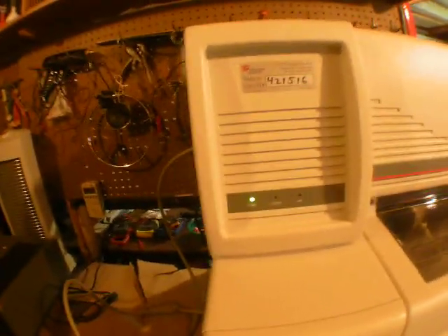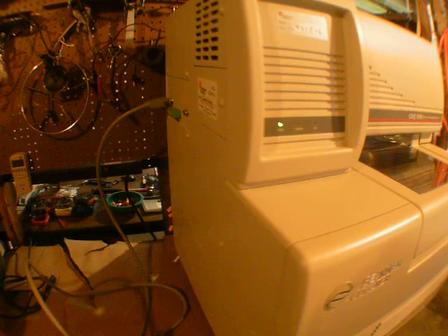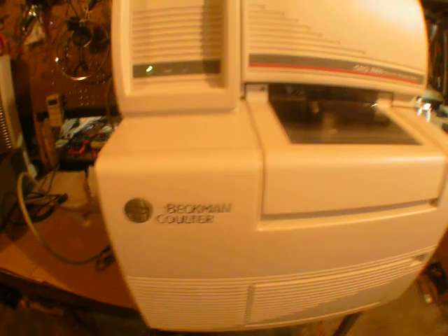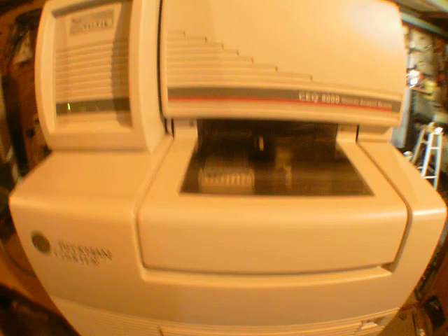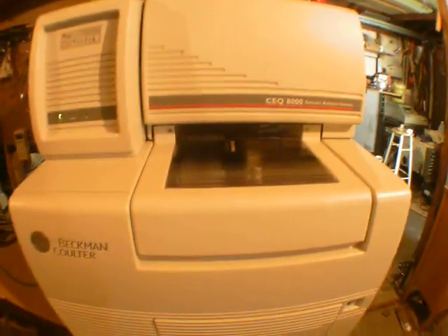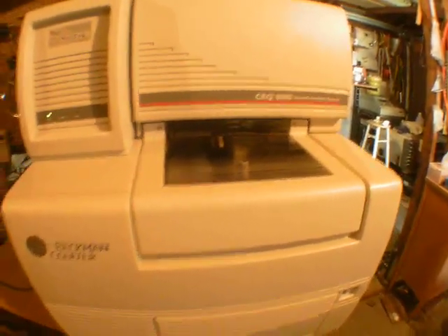Anyway, it's a good looking machine, in good condition. It comes with the cables, but I don't have a computer for it. Maybe someone who knows how to use it will have a better idea. Anyway, here you have it guys.